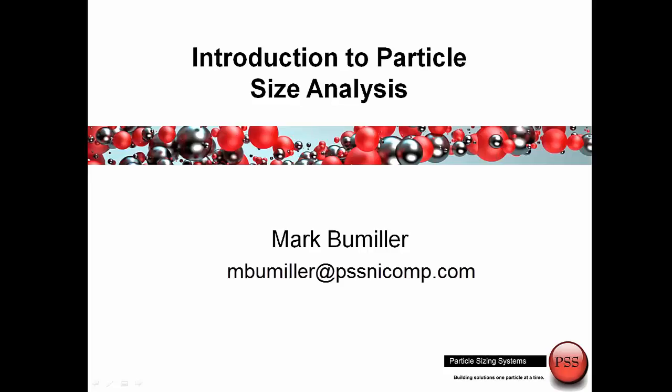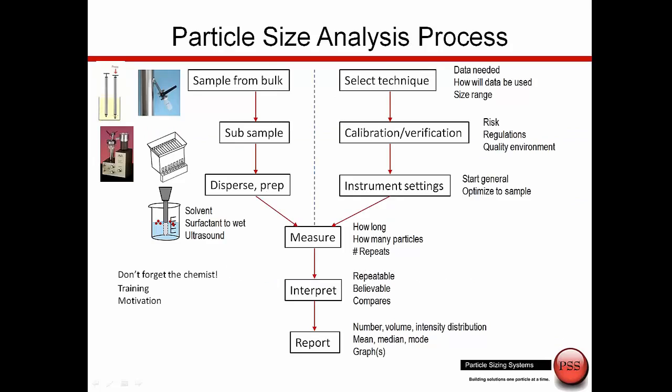So this is our presentation, which is an introduction to particle size analysis. Now we should think of the particle size analysis process as various steps that we should accomplish before we reach this end goal of even taking the measurement or presenting the results.